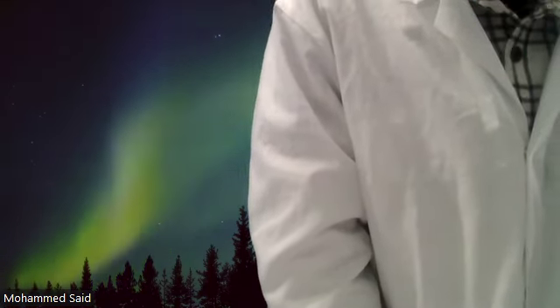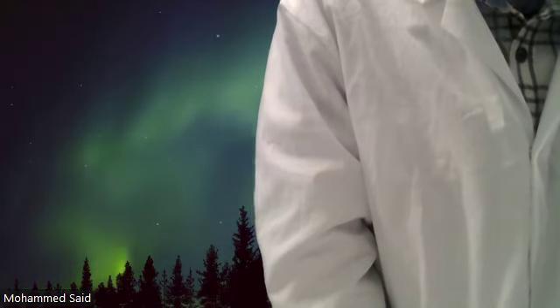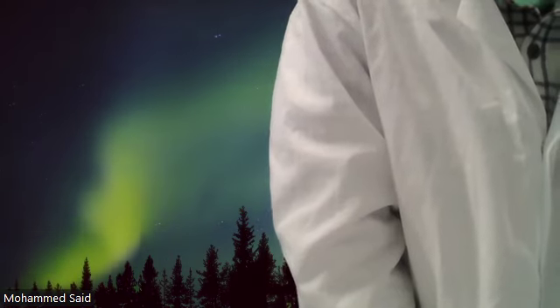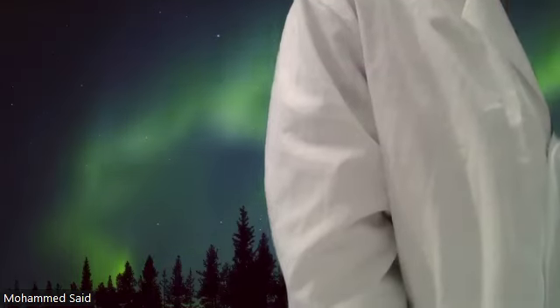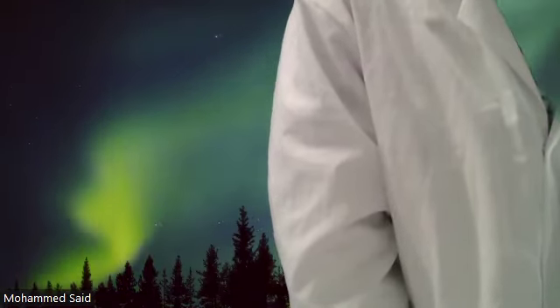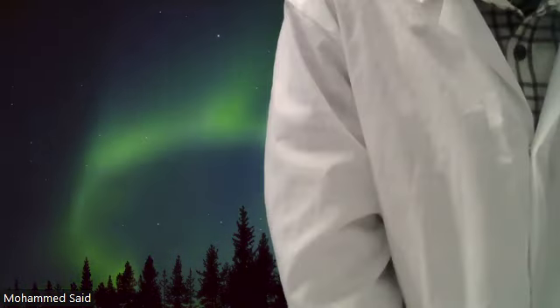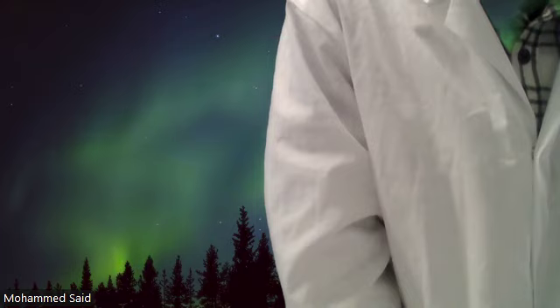But please, everyone, bear in mind that you're being not just proficient, but mindful with what you're doing. Please make sure that you're using the right unknown. You're not using someone else's, because otherwise you're going to get different results, right? Because you're comparing the negative and positive controls for gram staining and capsule staining with your unknowns. So just bear that in mind, everyone. And if you need help or support, just also let me know. Thank you.